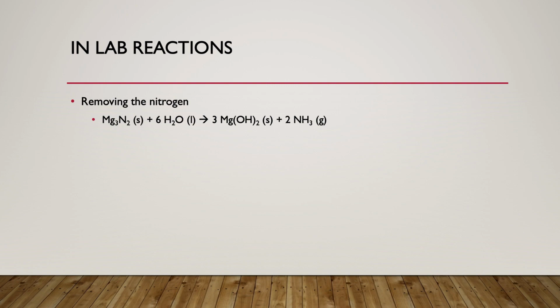And what's going to happen when we add the water and start heating it up again, the magnesium nitride is going to react with the water to make magnesium hydroxide, and also a little bit of ammonia gas. If you've never smelled ammonia gas, it's not all that pleasant. It will burn your nostrils. The same thing if you inhaled it at all. It would also burn your eyes if your eyes get exposed to it.